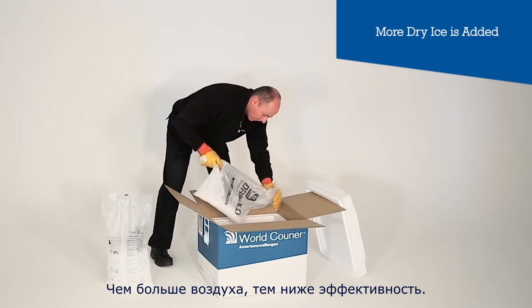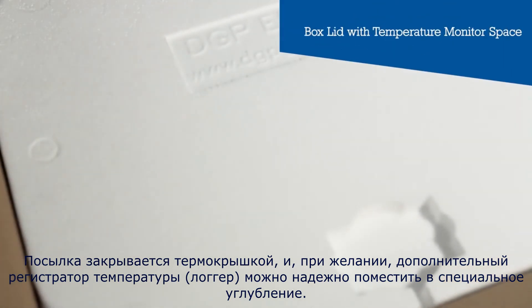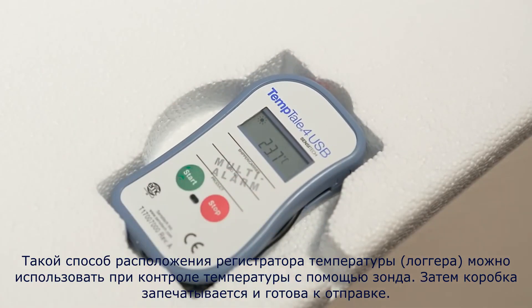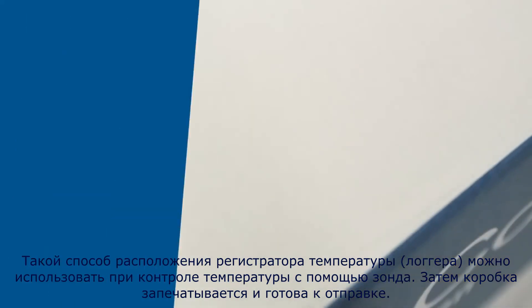The more air, the weaker the performance. The parcel is sealed with a thermal lid, and if desired, an additional external temperature monitor can be placed securely into the cut-out space. This can also be used for a probed temperature monitor. The box is then sealed and ready for shipment.